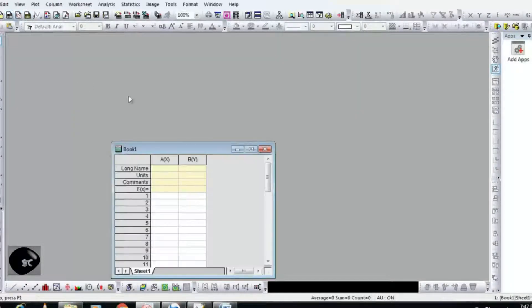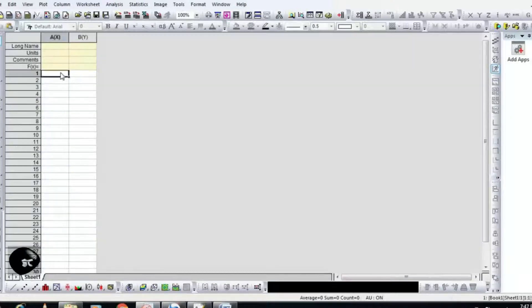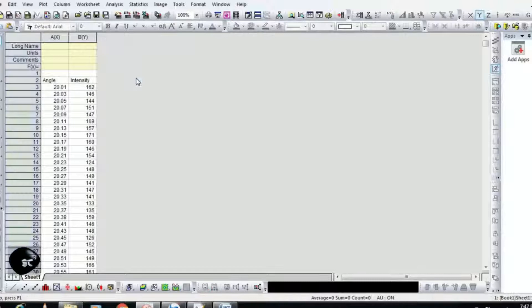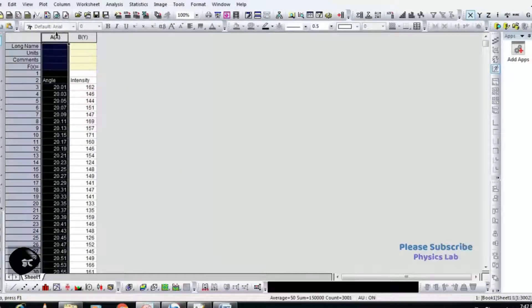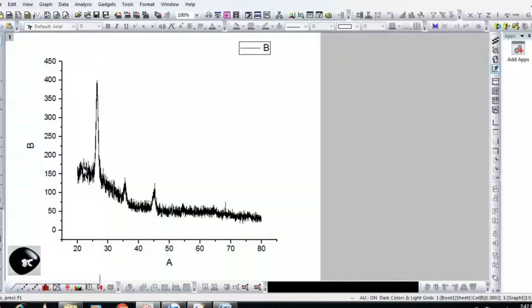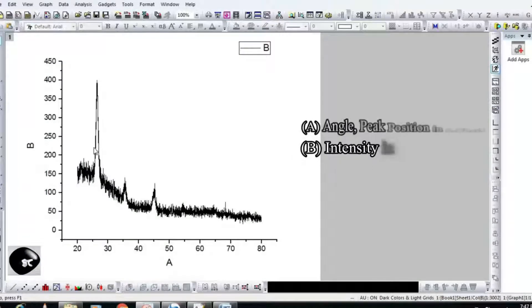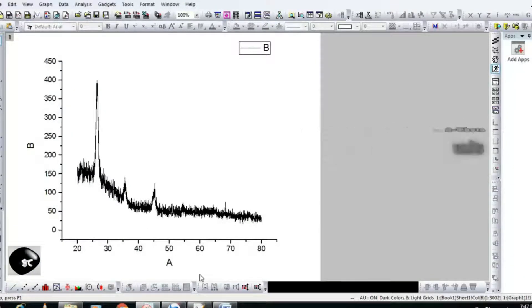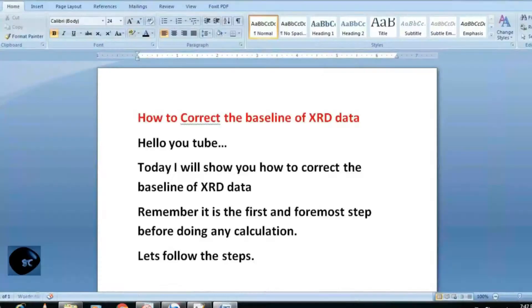Import XRT data. Along the X axis is the peak position in 2 theta, and along the Y axis is the intensity in arbitrary units.